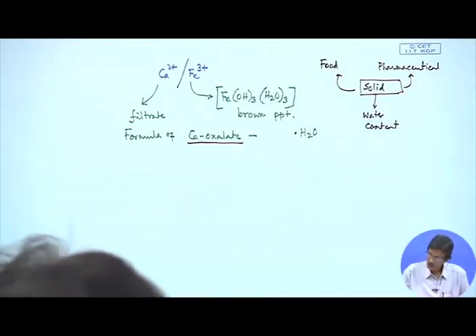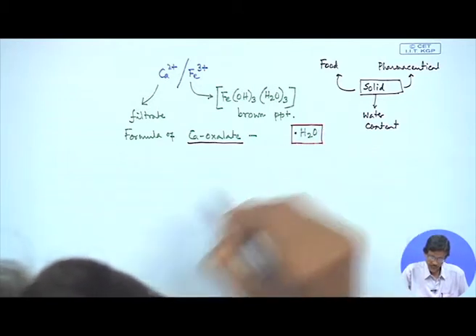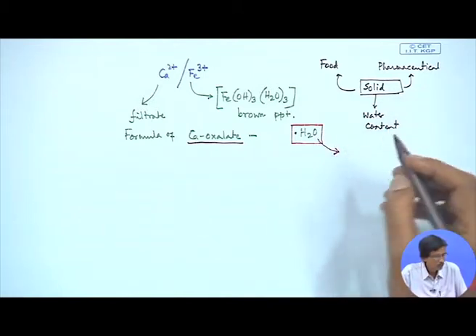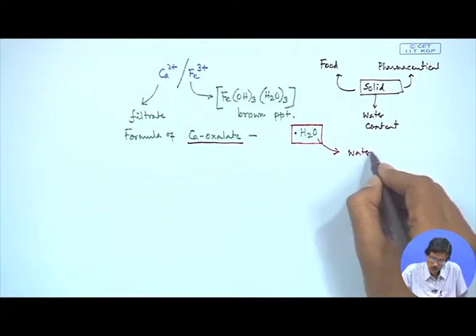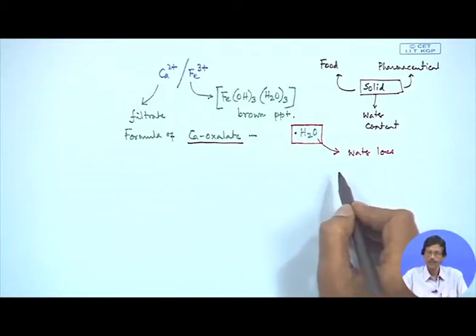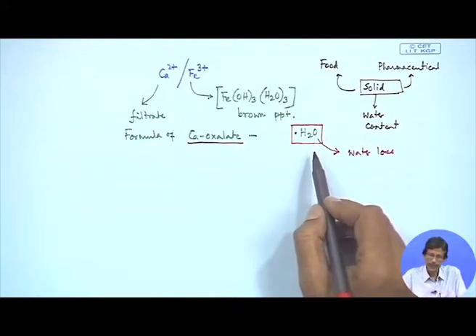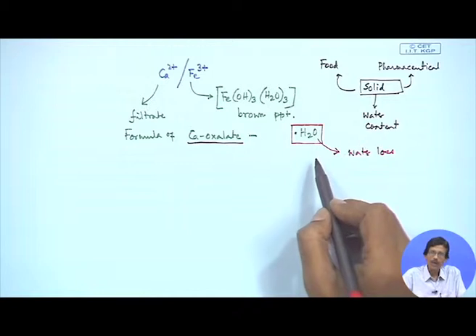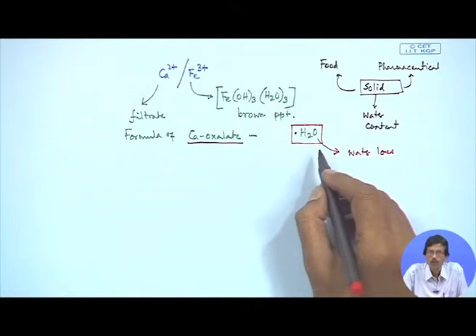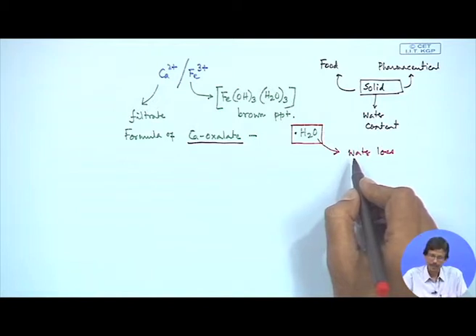So, this water content is always very important, and we want to know when we go for the TG analysis of any of these samples, because at a particular temperature this will go for the water loss, which is the first step, and that we can apply that information as we have discussed earlier in case of drying the precipitate of nickel DMG, nickel dimethyl glyoximate, in air oven. So, we should set a particular temperature, and we should know also at what particular temperature we can dry the corresponding sample of nickel DMG.